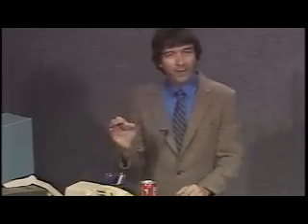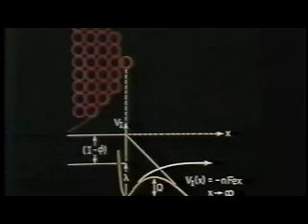If you think about that, every time one of those rings has collapsed, we've gone one atomic layer into the surface. 2.2 angstroms, built-in depth marker. Okay? So what we can do now is not only look at the surface, but we can look at what's inside the surface by field evaporating, by eroding the surface away and exposing something of interest. Now, there's been a great number of metallurgical applications using this process. Can I have the slides back again?